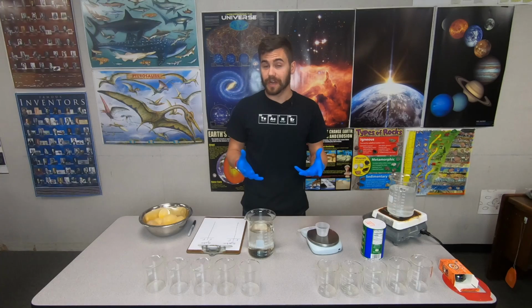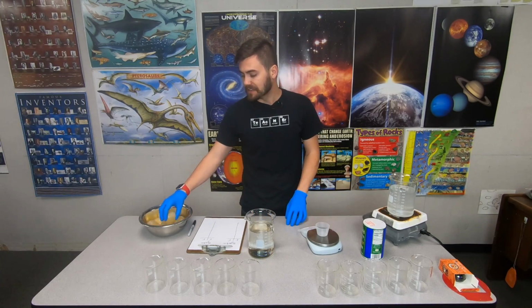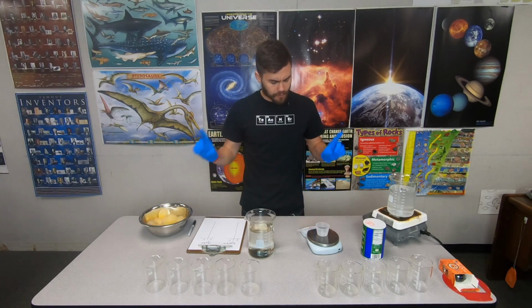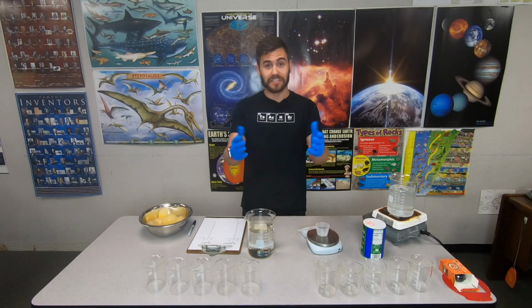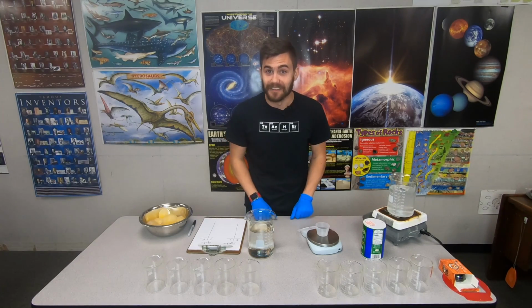Now, we can't watch osmosis happen, but we can measure the effect. So what we will do is we will calculate the mass of the eggs before and after diffusion, which I have to do that right now. It's going to take some time, but through the magic of video editing, it should take no time at all for you. Just sit back and enjoy the music.